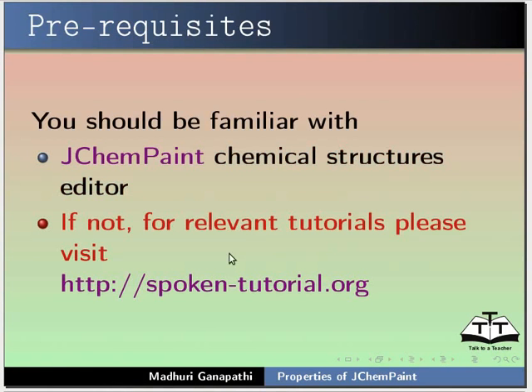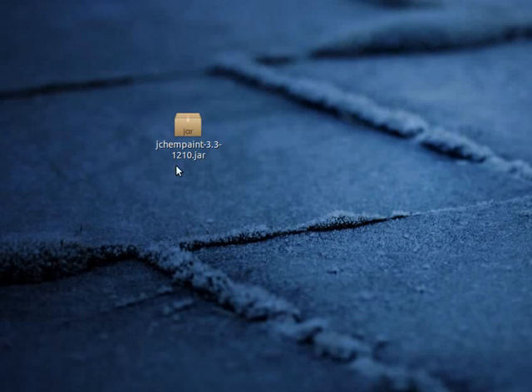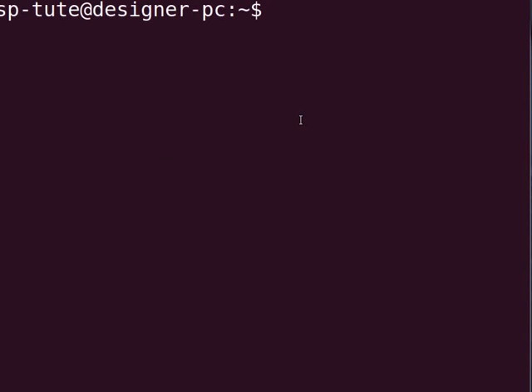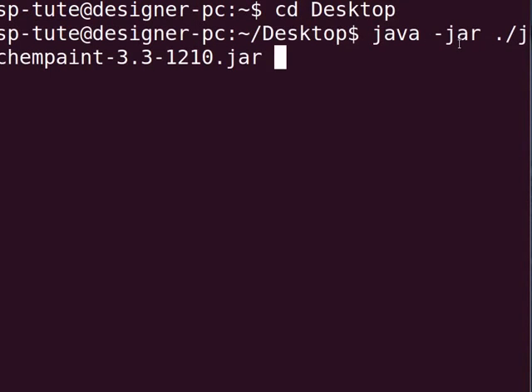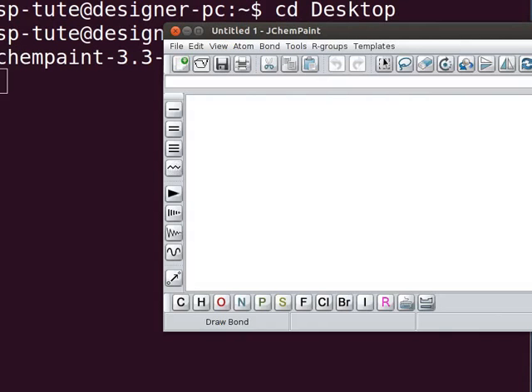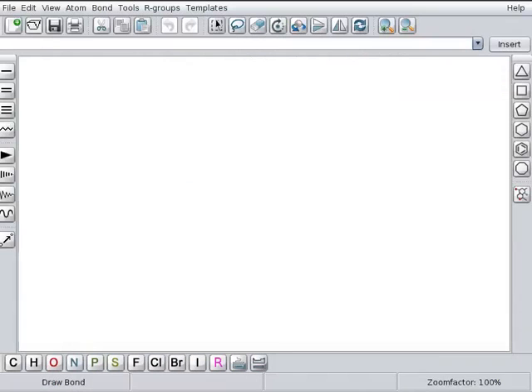If not, for relevant tutorials, please visit our website. Let us switch to jChemPaint window. Recall that we had saved our .jar file on the desktop. Press Ctrl-Alt-T keys simultaneously to open the terminal. Type cd space desktop and press enter. Type java space hyphen jar space dot slash jcampaint hyphen 3.3 hyphen 1210 dot jar and press enter. jChemPaint window opens.